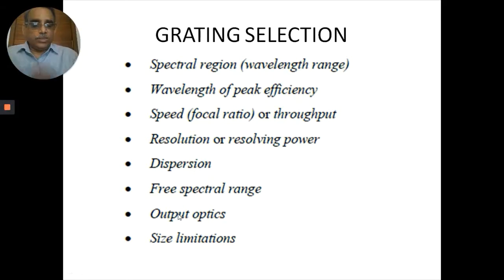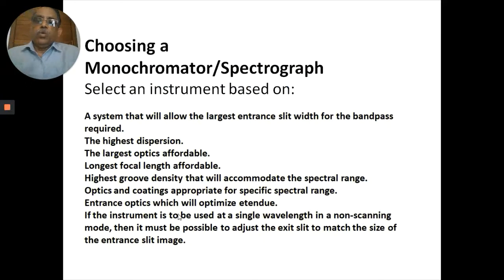So what kind of a grating you want to have inside the monochromator. Maybe it looks a little bit technical, but you should also understand the basics. Unless you decide the right grating, you may not be able to see good resolution, and you may not be able to avoid the scattering that is happening in the grating. This is very important.